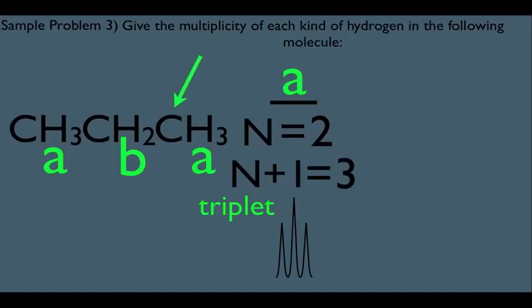Again, they're connected to this carbon right here directly, making this the neighboring carbon, which means these are its neighboring hydrogens. And again, there are 2 of them, so the N value would equal 2. 2 plus 1 again is 3. You would get the same answer, a triplet. So on an orgo test, we only have to evaluate one of them. However, the B hydrogens are not the same, so we should try to get their N values.